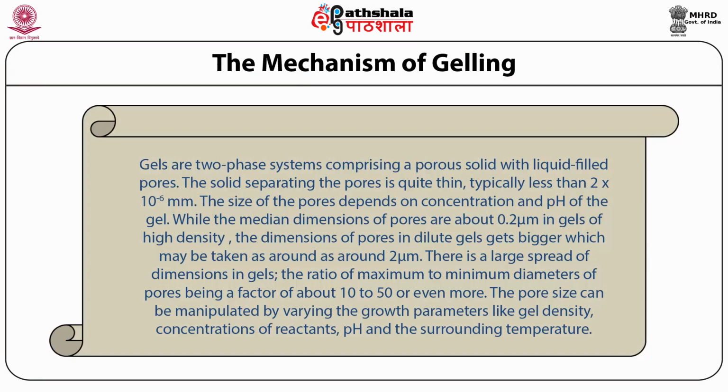The solid separating the pores is quite thin, typically less than 2 × 10^-6 mm. The size of the pores depends on the concentration and pH of the gel.